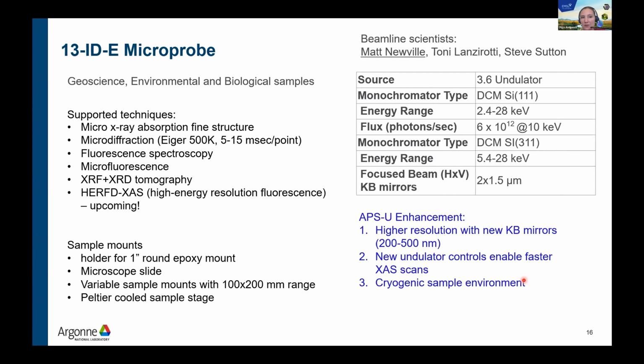And here's an example of one of the recent projects from that beamline, which was used for analyzing the pores and roots within the soil sample. 2-ID beamlines, we have two branches.